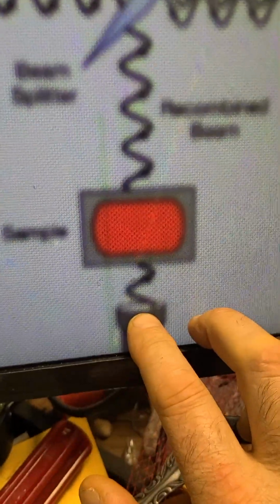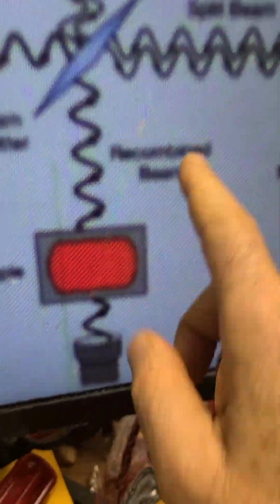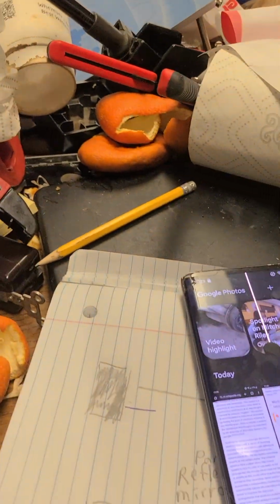And those two spots, even though it's a different wave, are going to combine constructively and destructively as you move the mirror the same amount of movement for a certain frequency. So it's as if everything was coherent if you keep the spots happening.